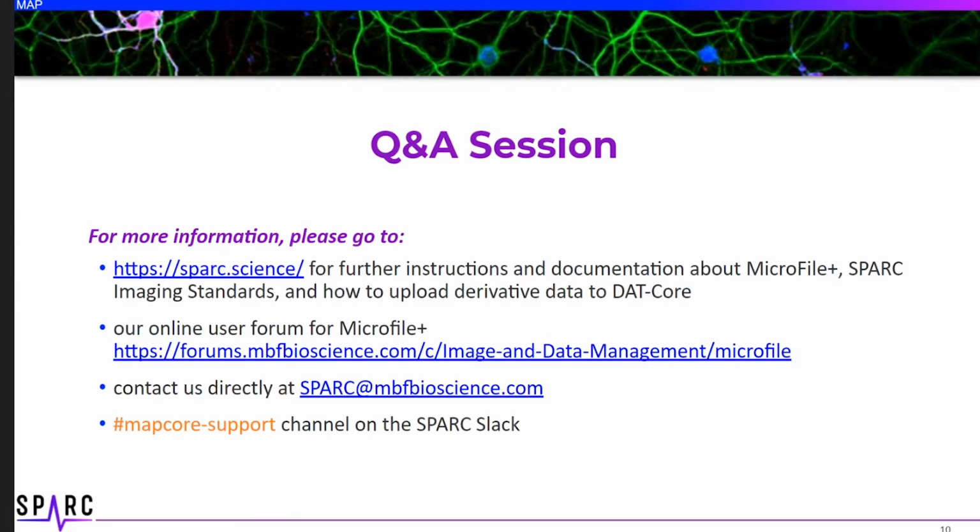Another question for maybe Dr. Oconnor or Dr. Tappan. The question is, what's the difference between TIFF as saved by Photoshop and OME TIFF?